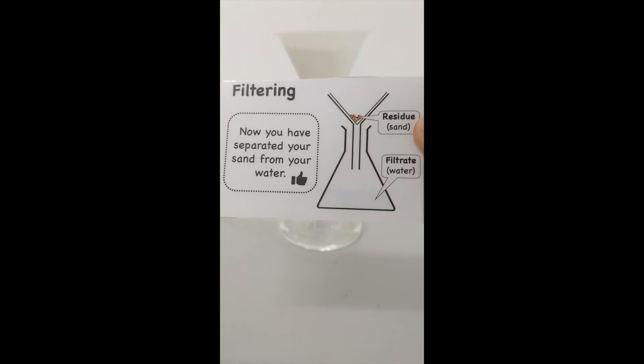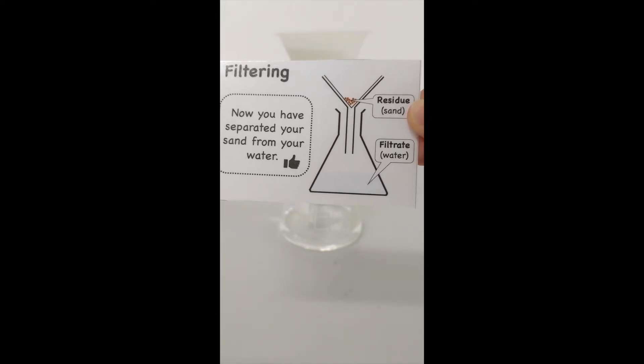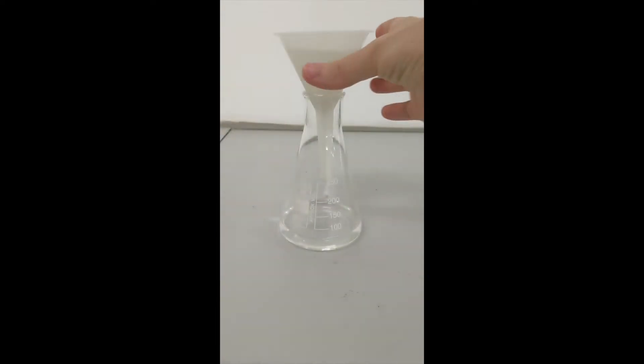Now we have separated our sand from our salt solution, our filtrate. And we're left with the residue at the top. This is the stuff that can't get through the filter paper—it's too big.